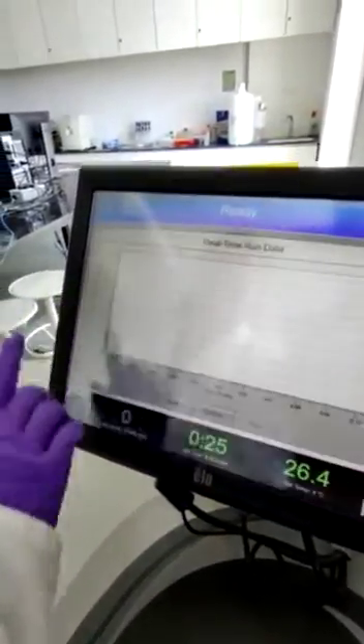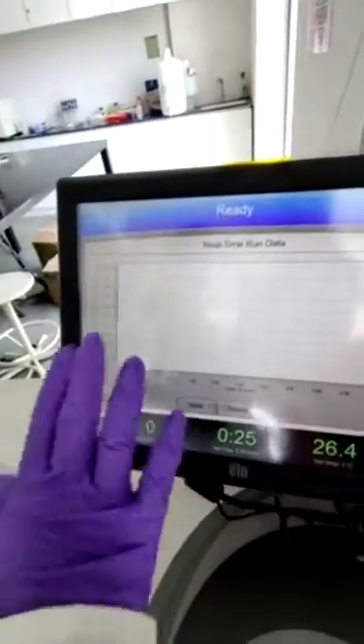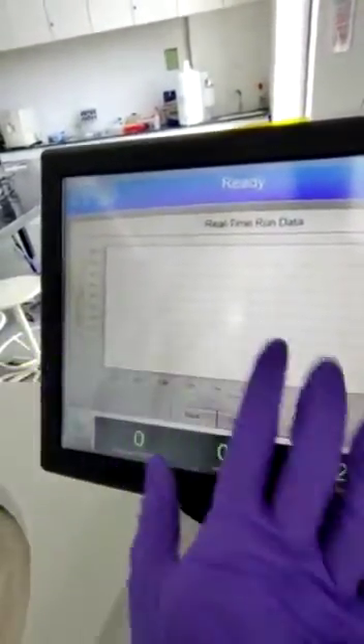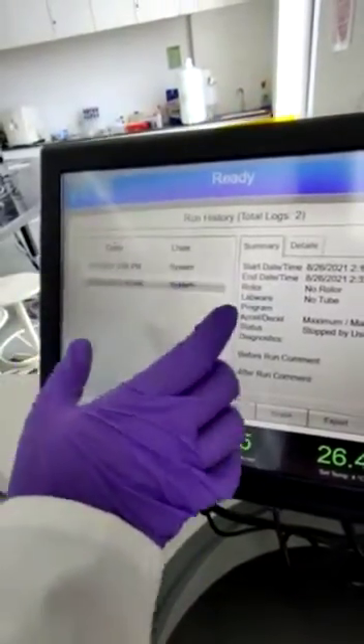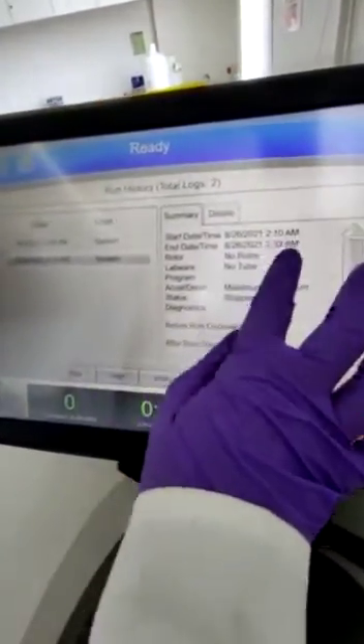Going to the second tab, it measures real-time run data since it will perform live monitoring of your sample — a graph will be shown while your system is running. You can also have a run history showing at what time and date your sample run was started.